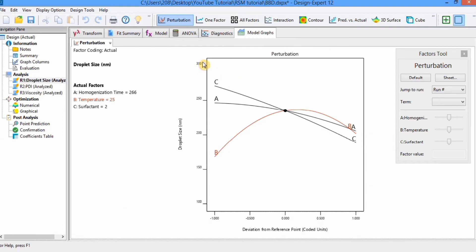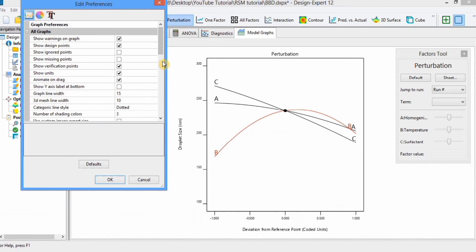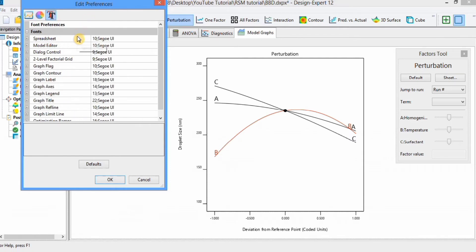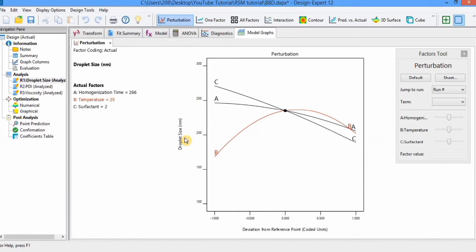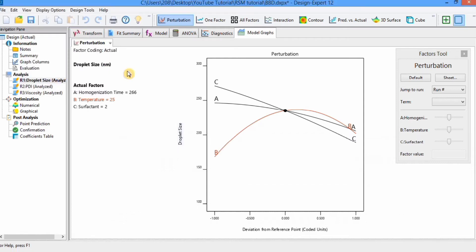If you want to edit the labels, simply right-click, go to graph preferences, and you will find plenty of options for editing the graph. You can change colors and text using the available options. If you want to edit specific labels, right-click and go to edit text — you can write any name there. For example, if I remove 'nanometer' and click OK, you can see it has changed.